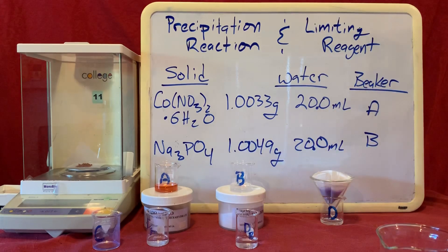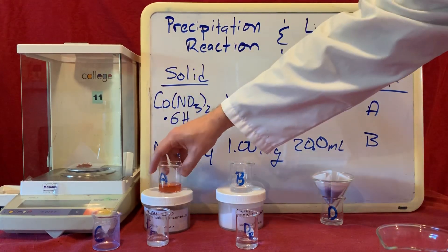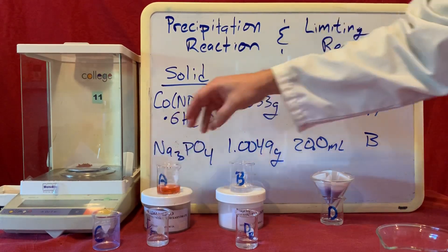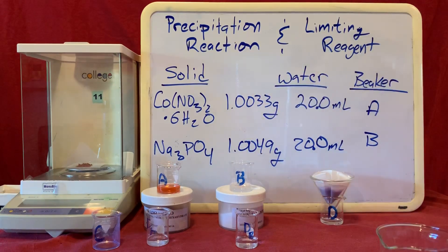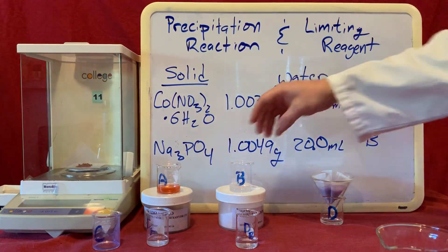Now to solution D sub A, I'm going to add the rest of solution A, see what happens. To D sub B, I'm going to add the rest of solution B and see what happens.